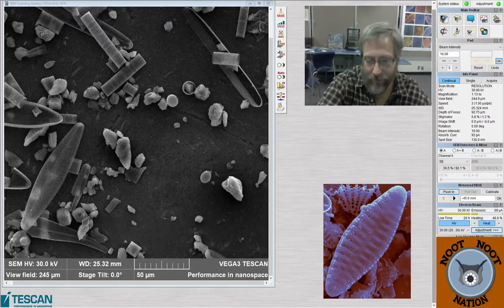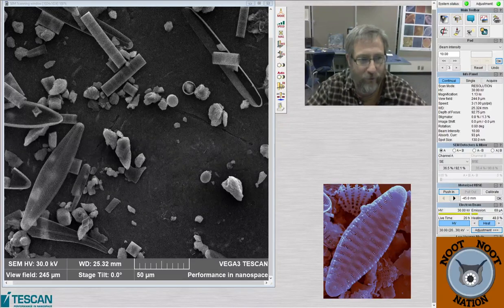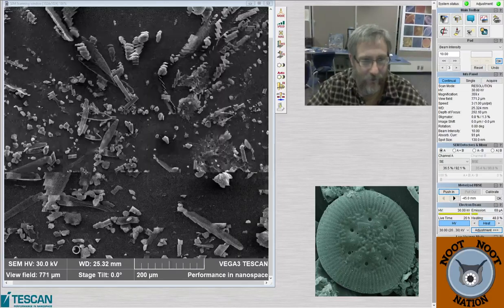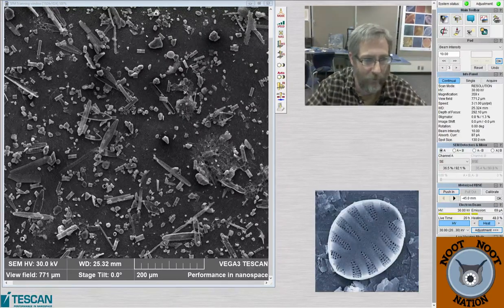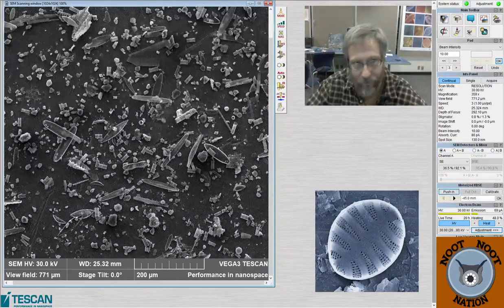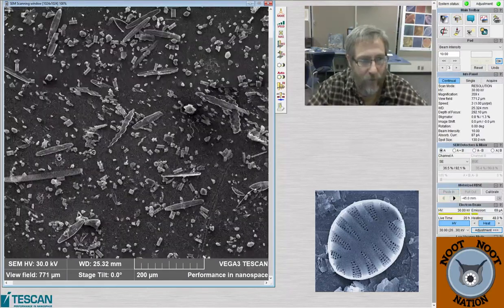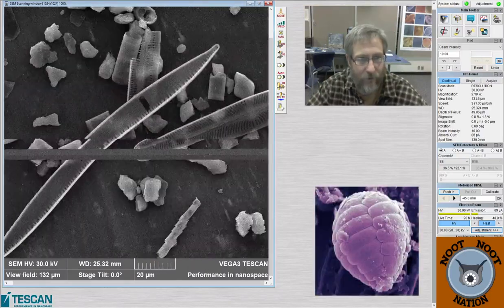And also I didn't have to do anything else after that, right? I just handed over the files to a photogrammetry person. They stuck it into Agisoft, and it spit out this really cool model that is based on the organism itself. So it's not just guesswork or somebody doing it in AutoCAD or whatever, but the actual organism. I really like that about it, and I think it's a neat process.